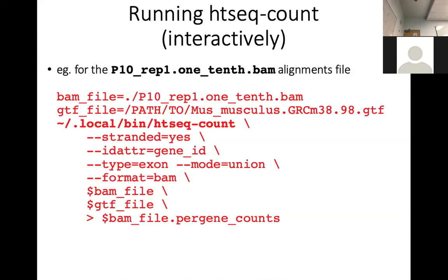So I'm still a little bit confused about the dollar sign. I'm already in the directory where the .gz file is. $variable_name, right? So you're just writing a name, and that's a name that's going to be replaced with content.